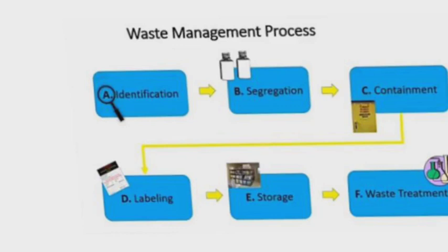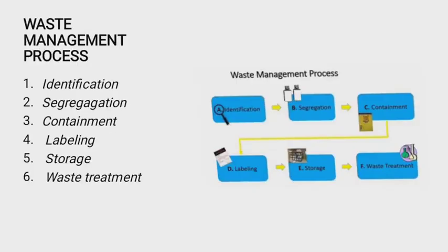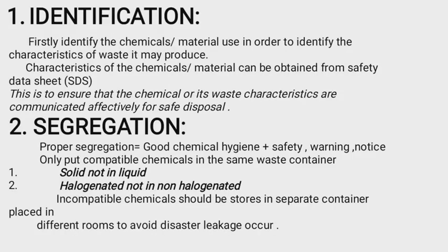And F is the waste treatment. Lastly, treating the waste to reduce the toxicity, and waste disposal by a vendor. And then we will discuss these processes in detail. Let's start. And first is the identification.